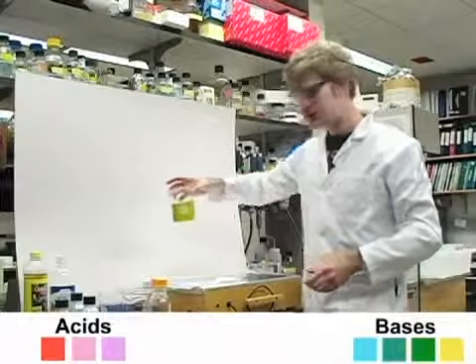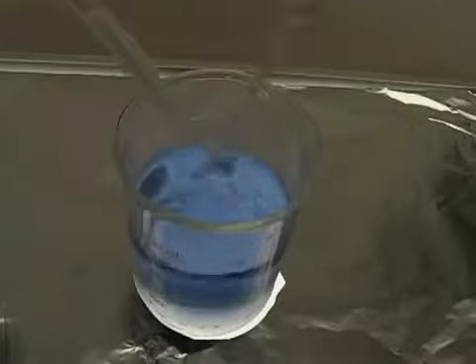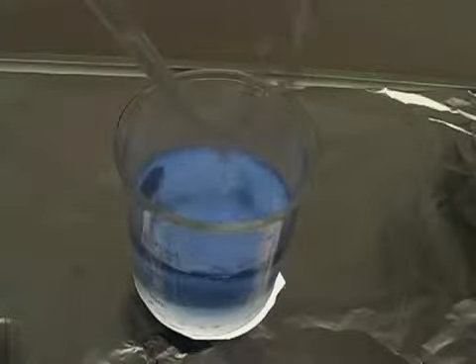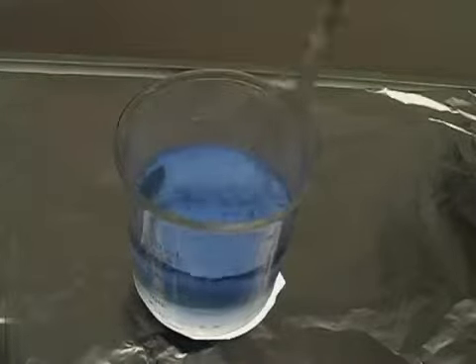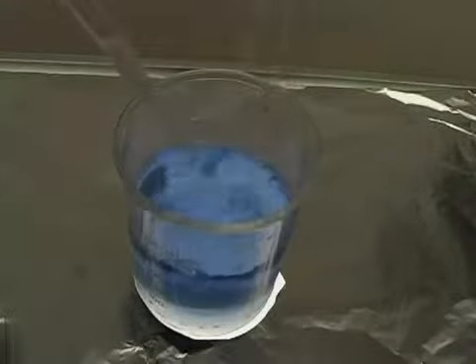Okay, let's look at another example. I have a third chemical here. I'm going to add some of it. Dropping it in here, lots of drops, and I'm not really seeing any change. The color remains the same. And as you'll see, I can add as much of this as I want, and the color's still going to stay this blue-purplish color.